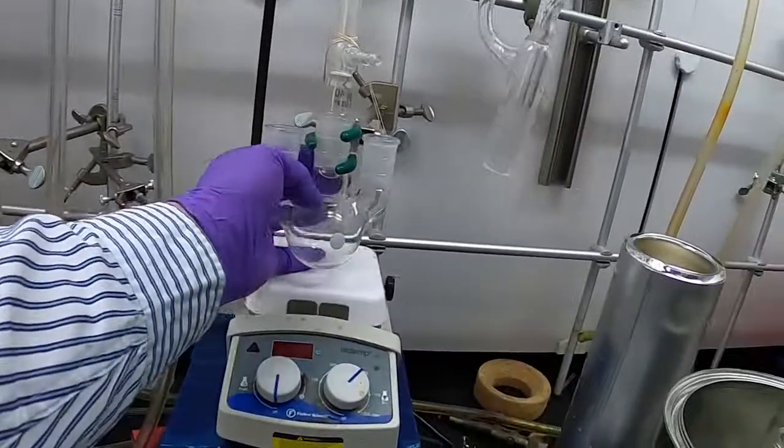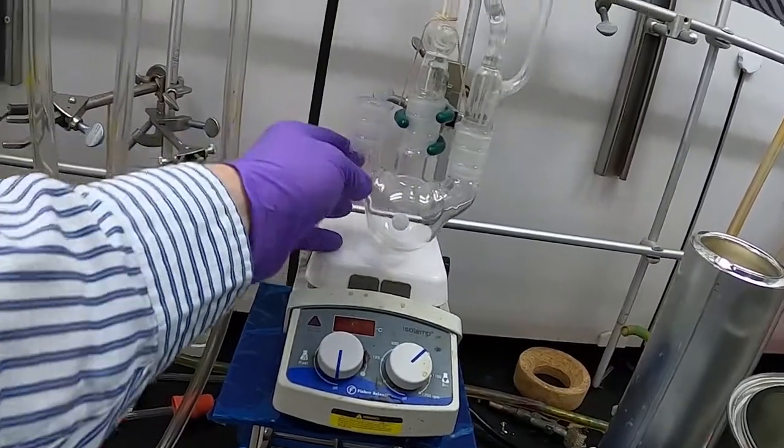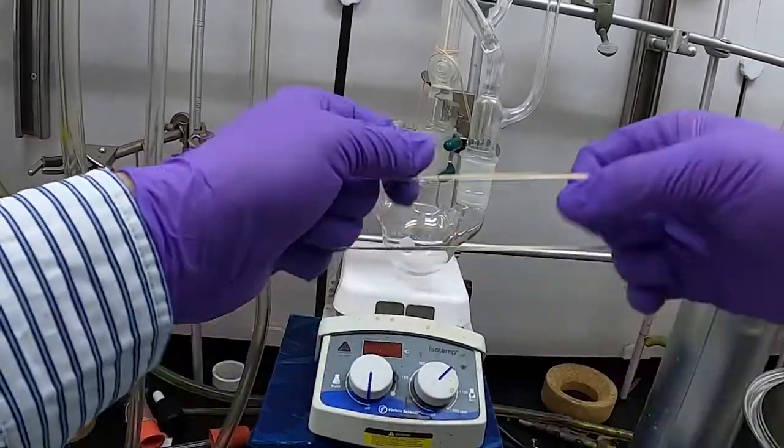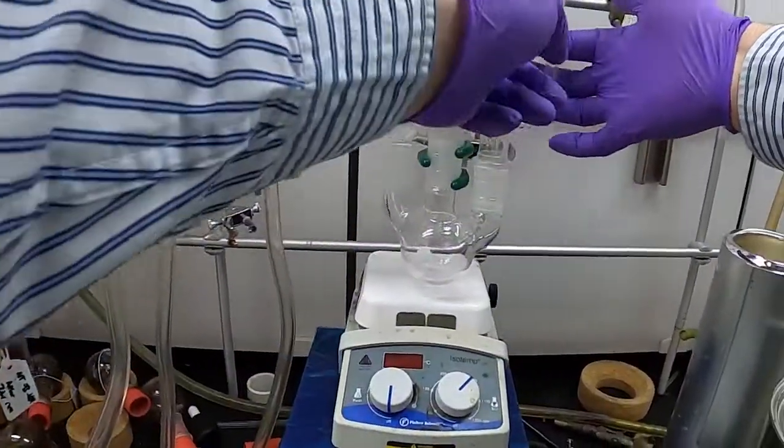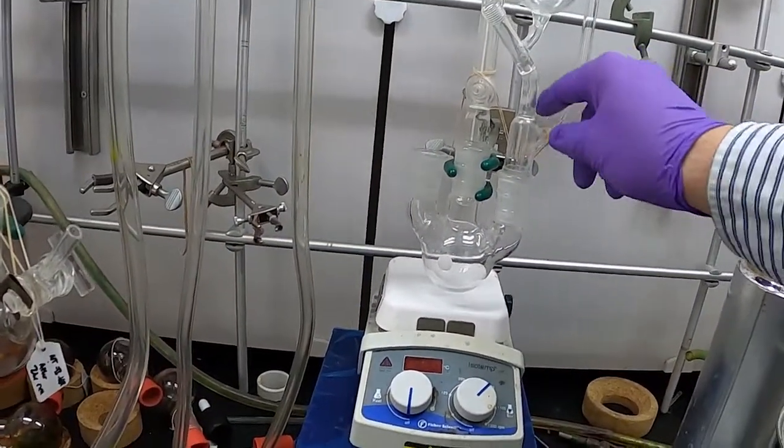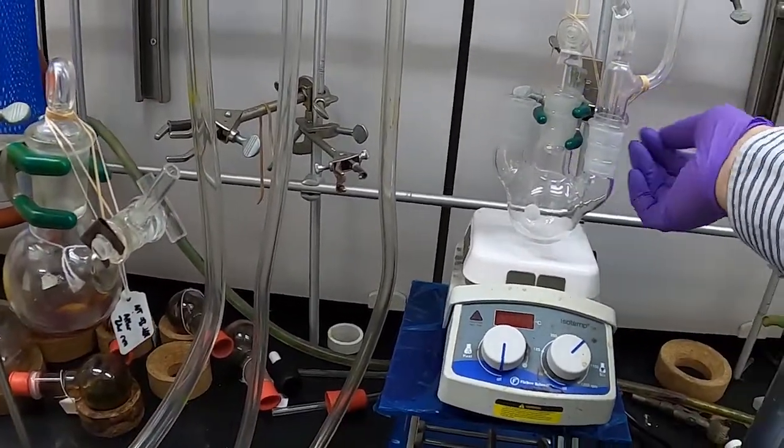Same thing goes now if we add an addition funnel. So we'll add an addition funnel here. If you want to have some kind of downward pressure, again you can do something like this: put it on there and then back down. So again, holds it down—some kind of downward pressure. You can sometimes even wrap it around here if you want, anything along those lines.